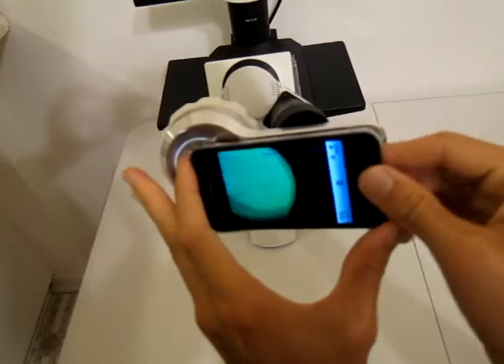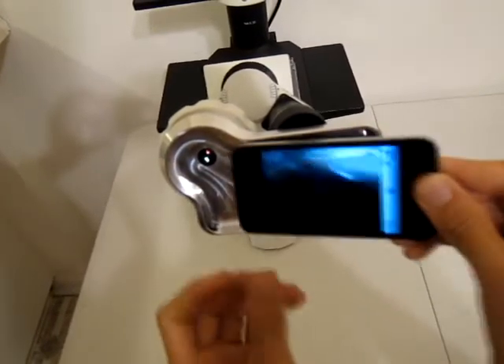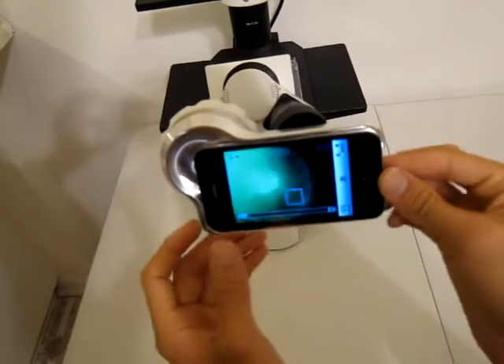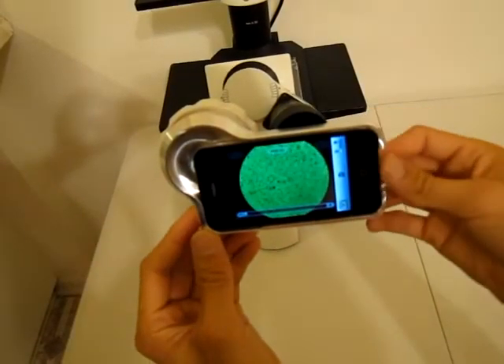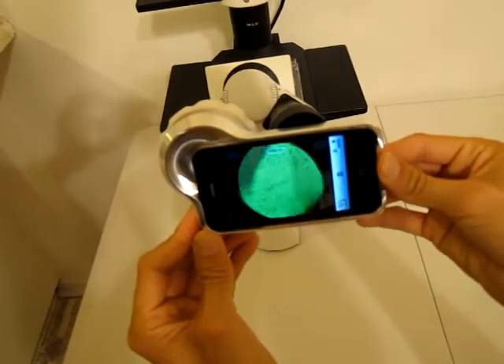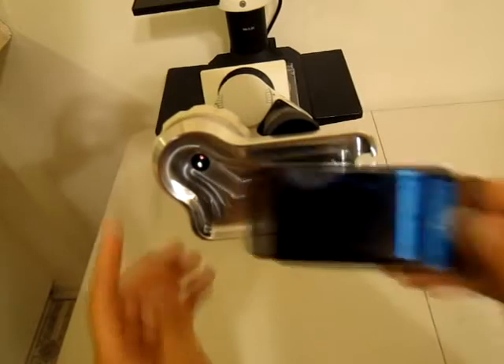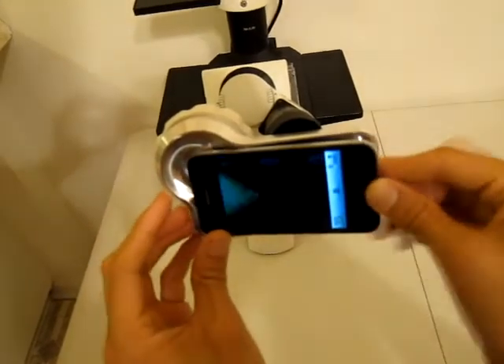If you want to remove the iPhone, you just tilt it out like this. To put it back in, put the top in first and then push it back in like that. It should remain aligned any time you take it out and put it back in.